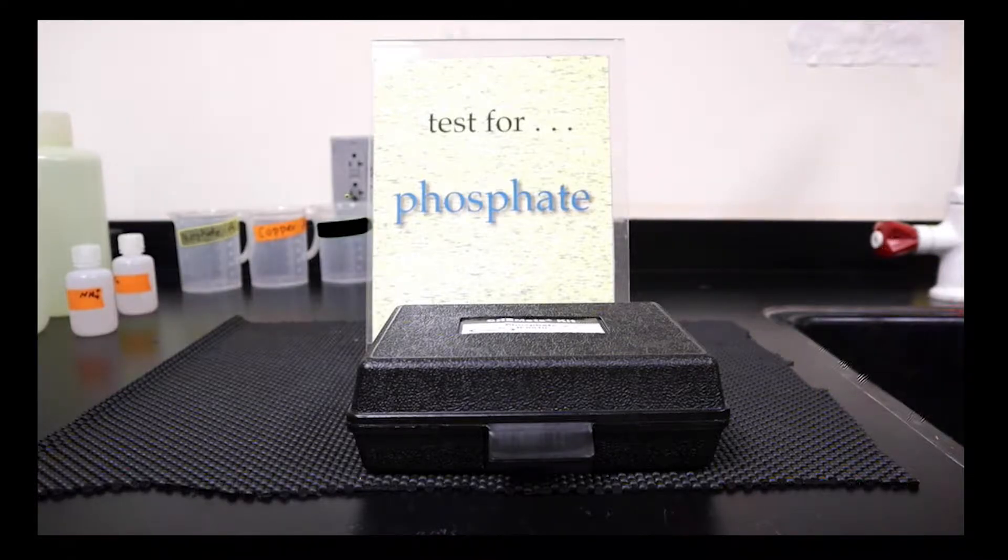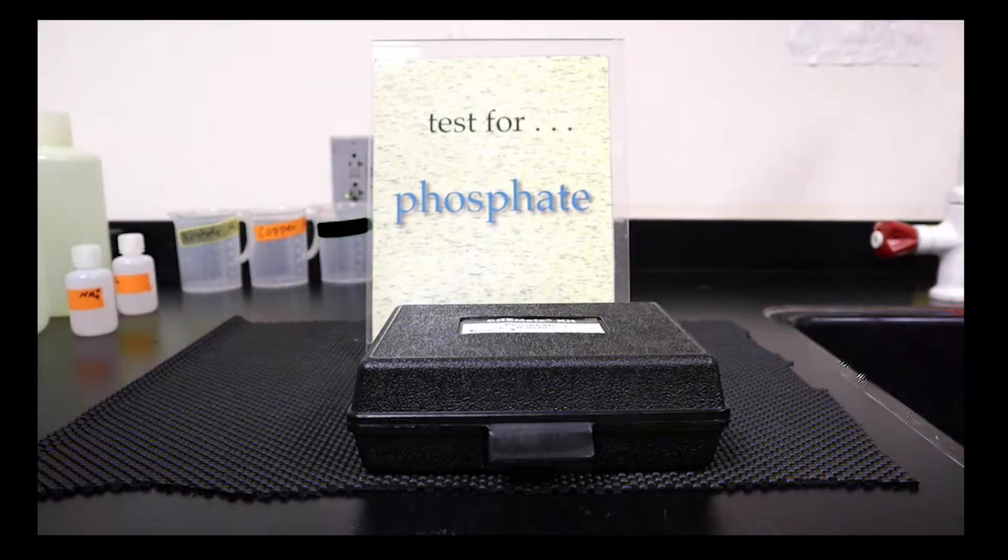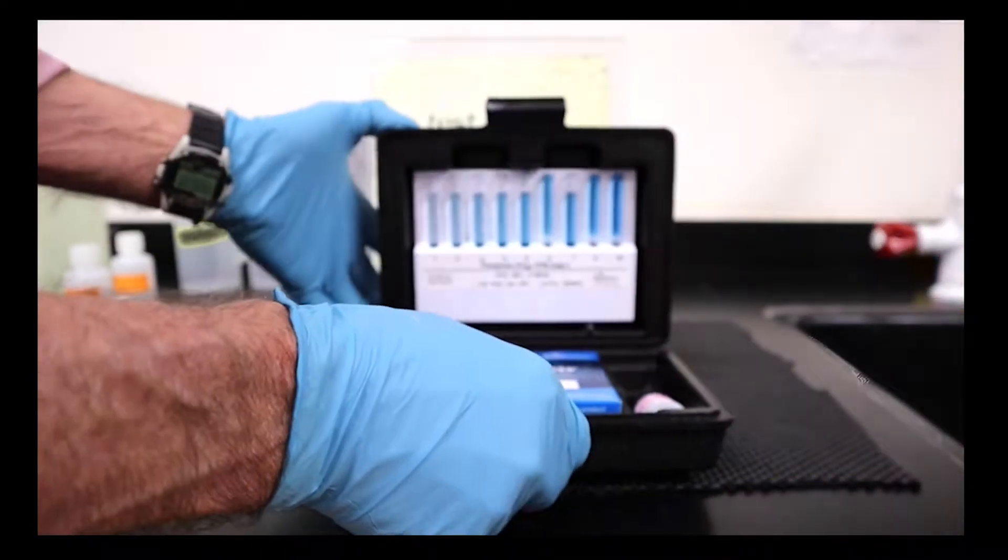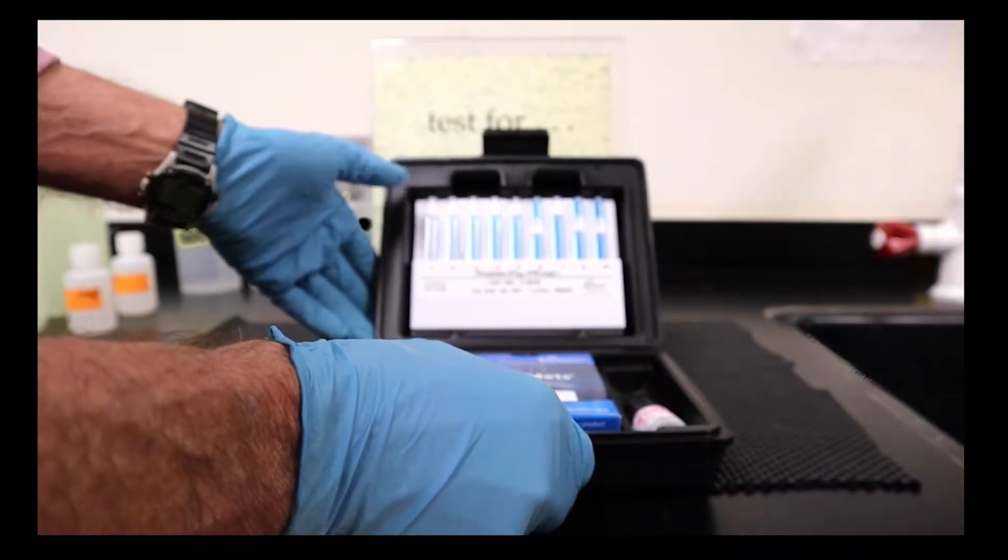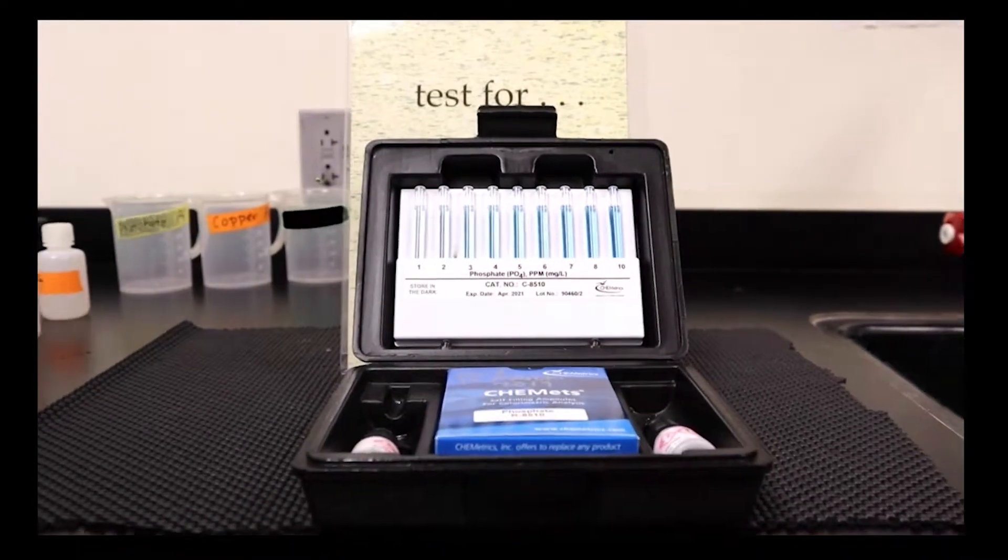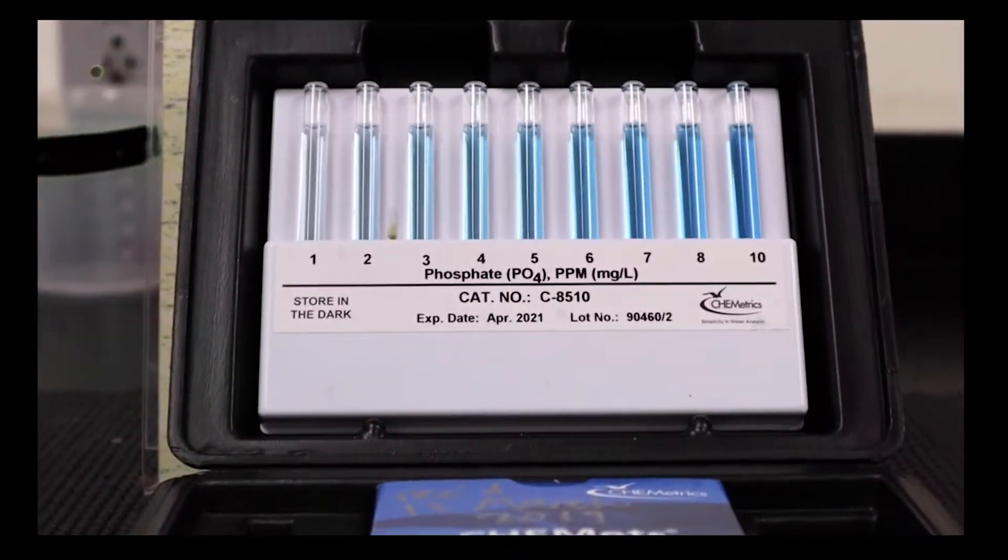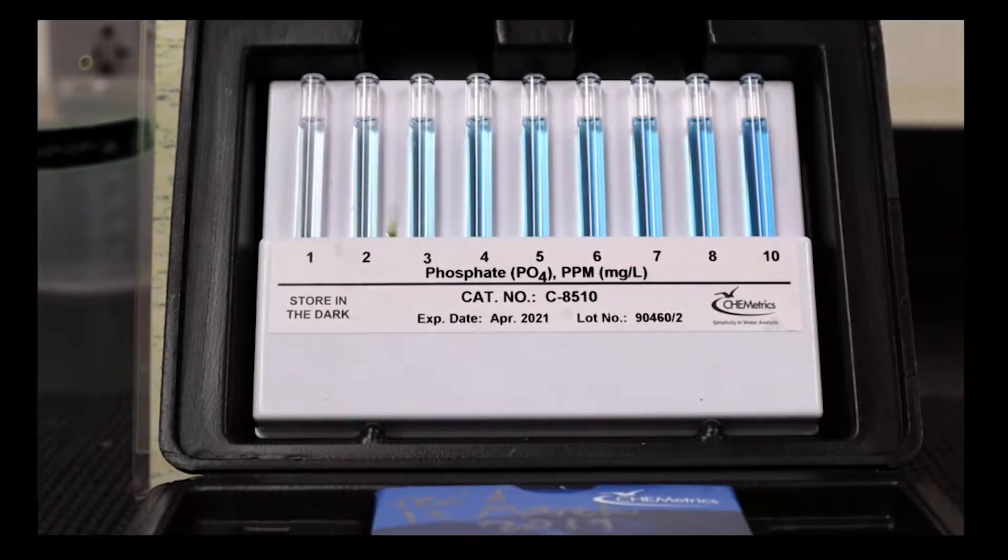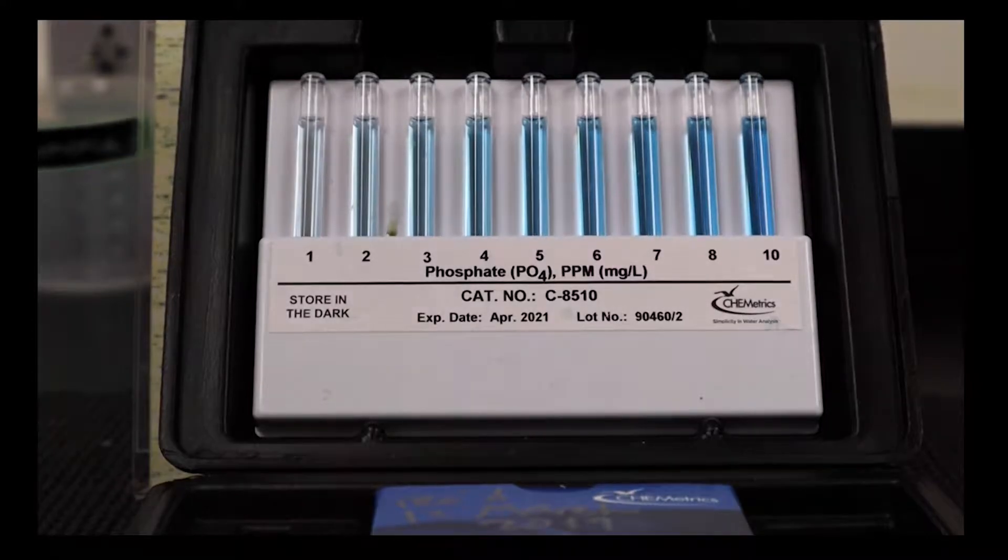There's a little test kit which is really a colorimetric test. What we're going to see is by taking a water sample and adding reagents, we're going to develop a color that depends on the concentration of the potential contaminant.